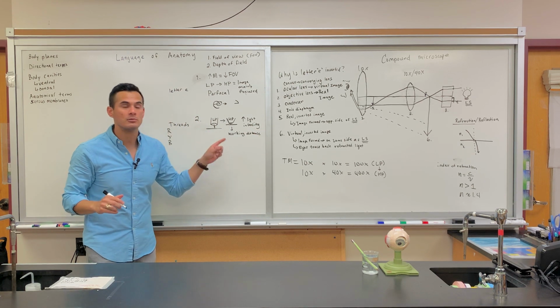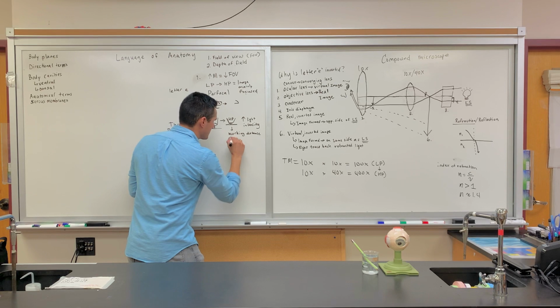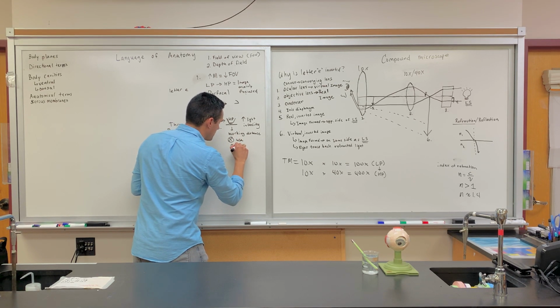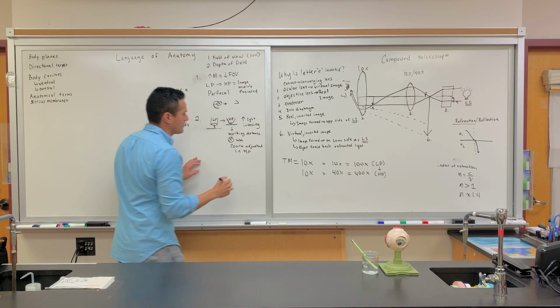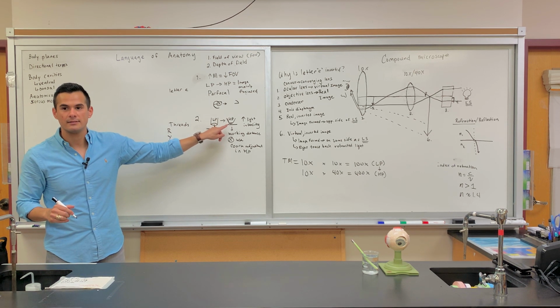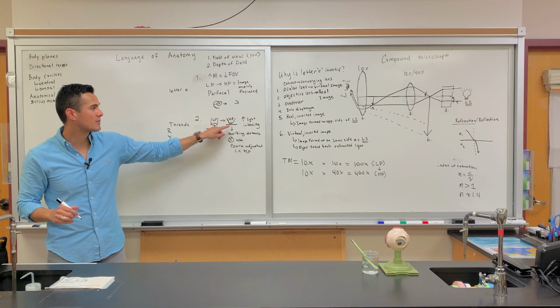This is why you do not use the coarse adjustment in high power. Because if it's too close, what's going to happen? You're going to crack that slide.